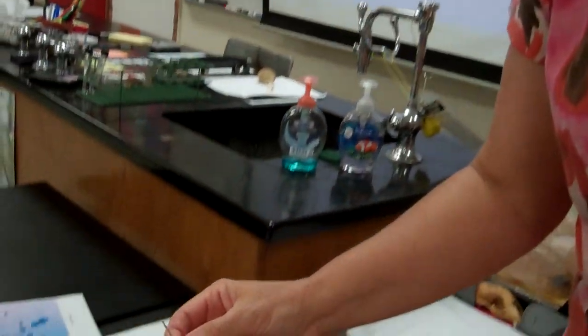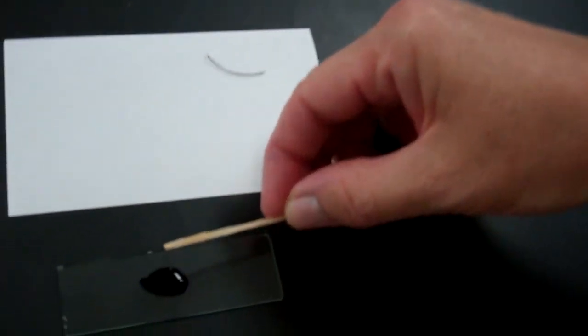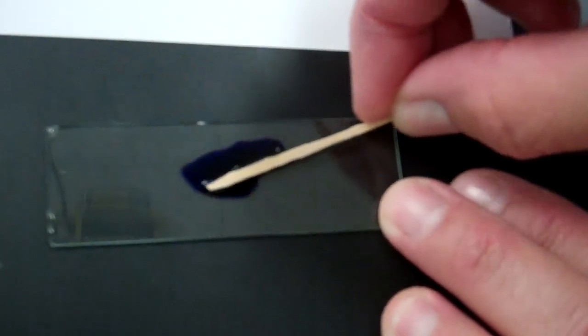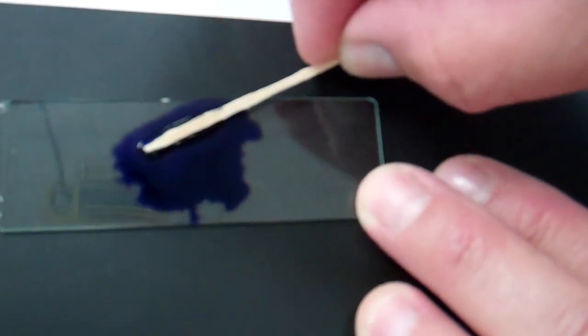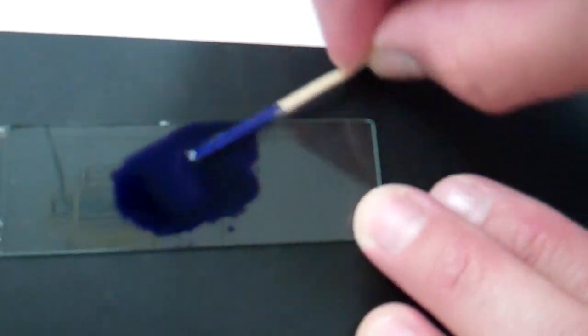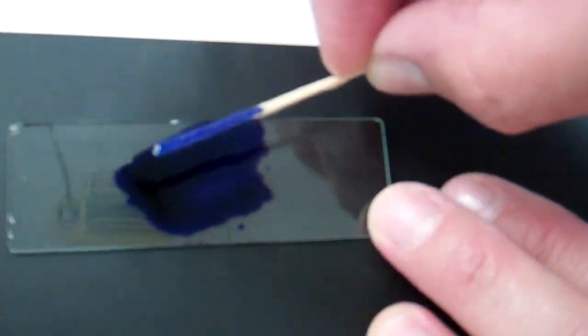Once you do that, you're going to swirl it into the dye. One side, spread the dye out, flip it over. Do the other side and get all your cheek cells spread out. And then you're going to throw that away.